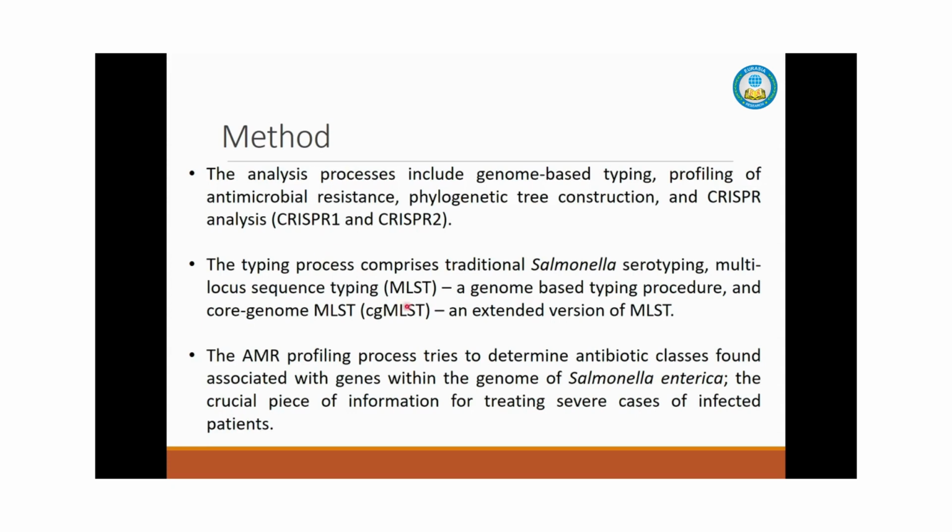The typing process comprises traditional Salmonella serotyping, multi-locus sequence typing, or MLST, and also cgMLST, which is core genome multi-locus sequence typing. Also, the tool can find AMR profiles. AMR means antimicrobial resistance.